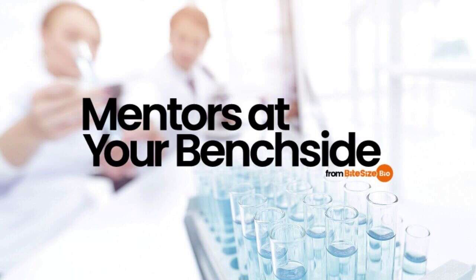If you are unsure about any of your buffers, make them fresh and try again. This often resolves the problem. If the smeared bands are especially large and prominent, you have likely overloaded protein. Reduce the amount of sample loaded.